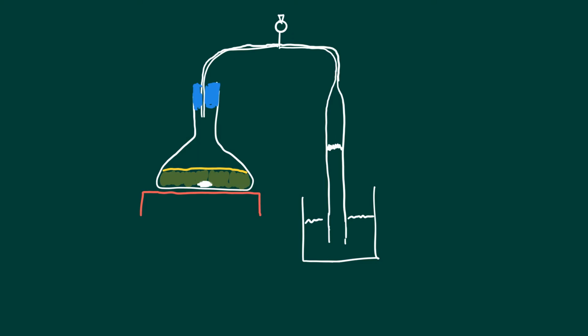So basically what's going to happen is they're going to produce CO2, and the CO2 is going to flow through the tube. We're going to have a little device that's just to control the liquid level in that upside down pipette. And what will happen is gas will form at a certain rate, and it will displace, and I can draw on here, it will only displace this liquid level. So it's all about getting the delta V over delta T, which will be the RCO2 rate. This is what it's about, people. So it is about how fast your level in your pipette is dropping, because that will be telling you how fast the organisms in the mixture are producing ethanol, or more effectively, how fast they are producing energy for themselves.